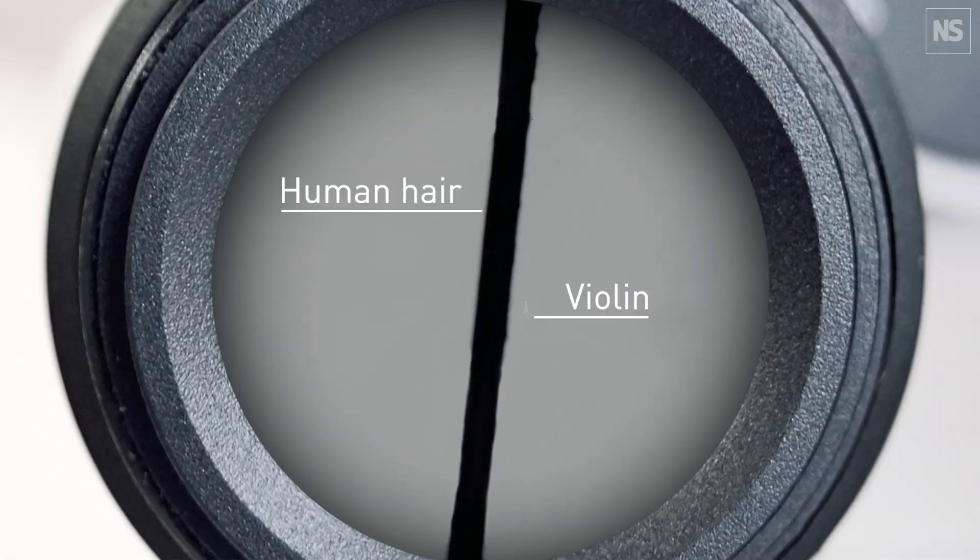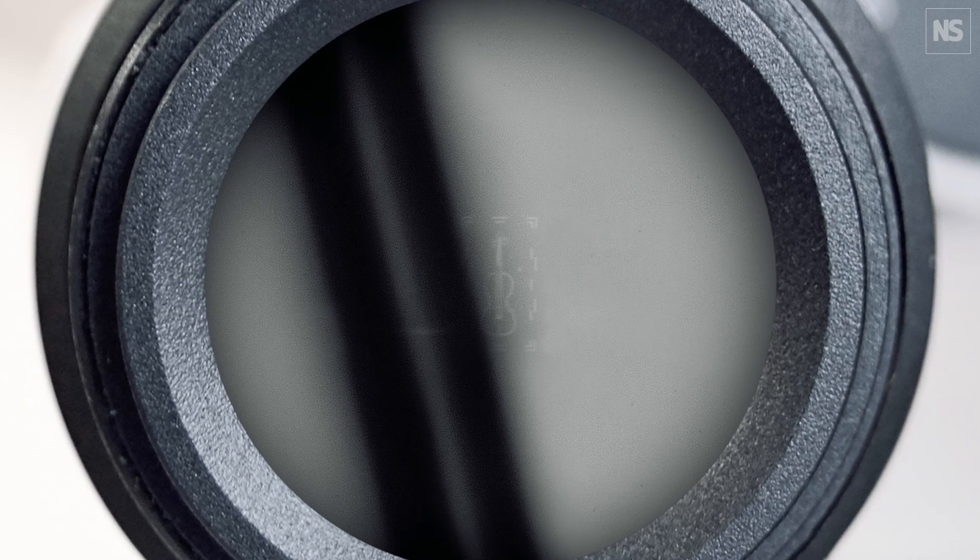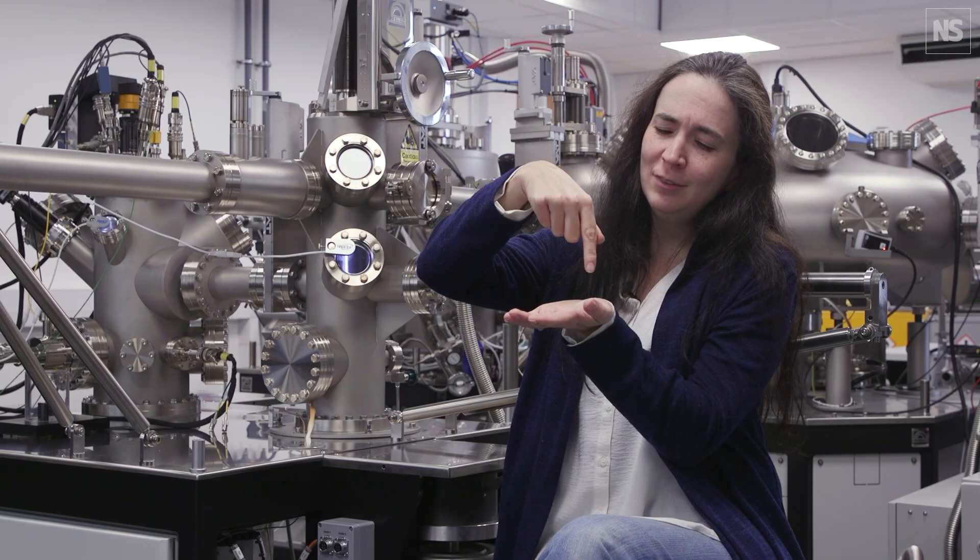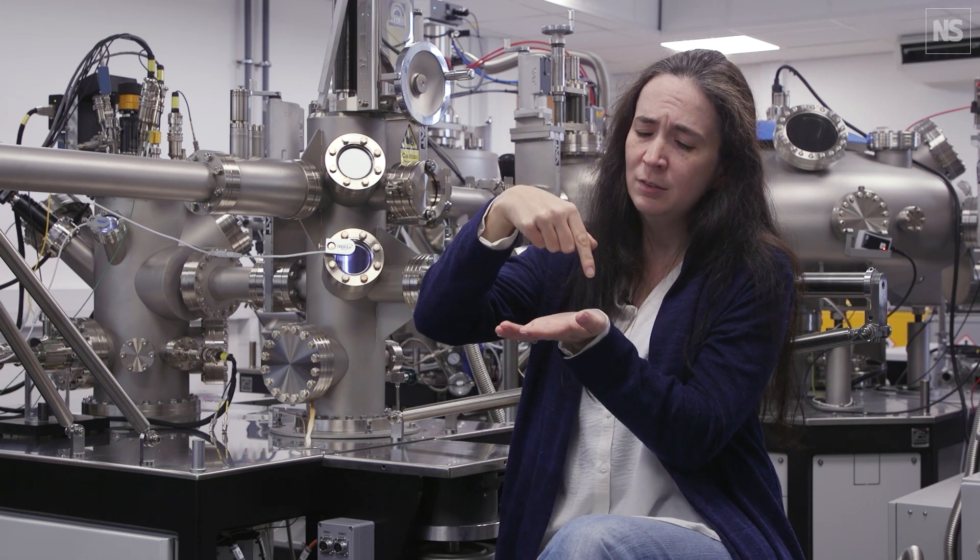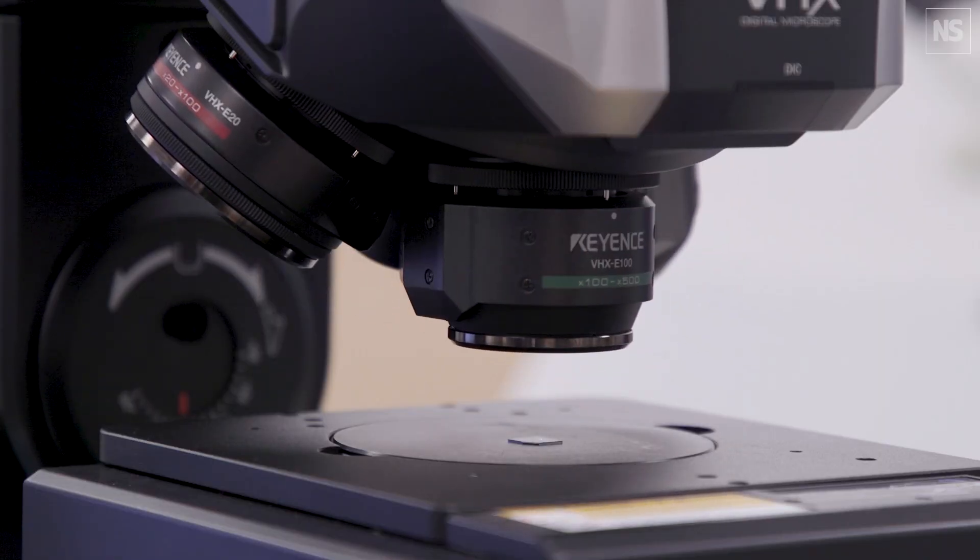If you take the average human hair, something between 15 and 120 microns, it's smaller than that. You have to use the interaction of this needle with that material. So you've got these atomic interactions to then see what you've patterned.